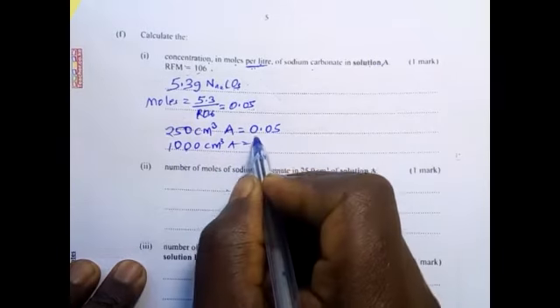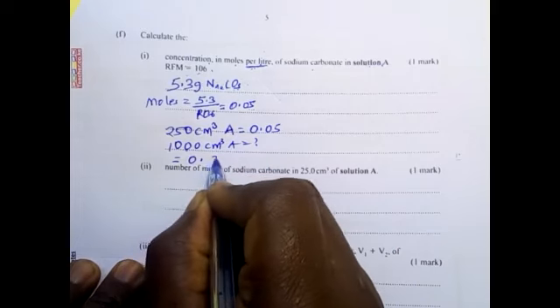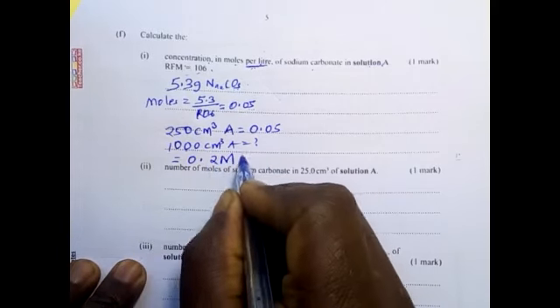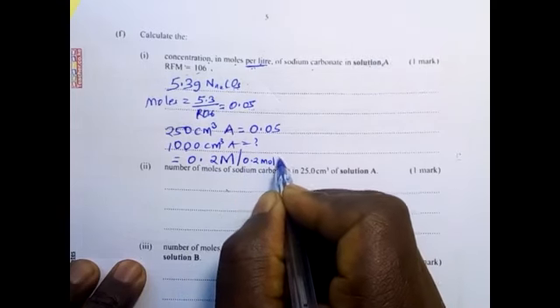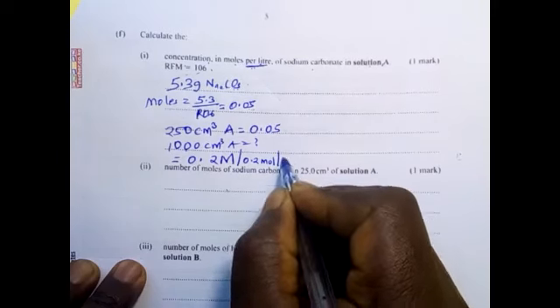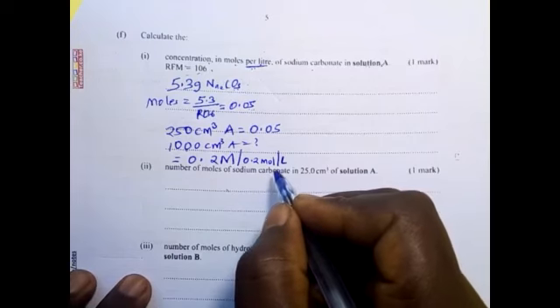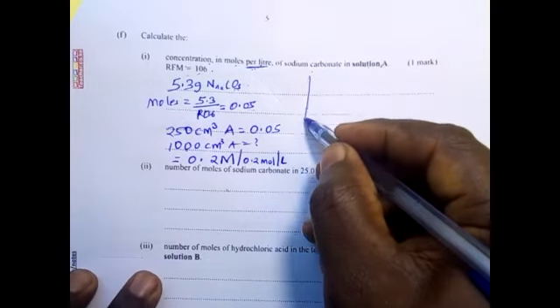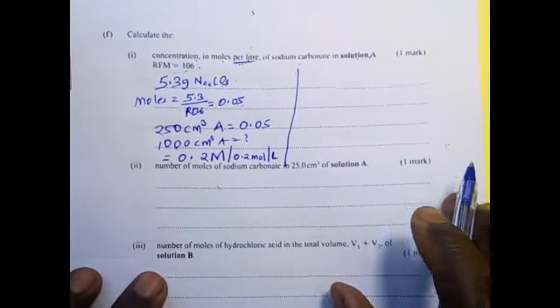So it is 1,000 times this divided by this, which is going to give you 0.2 capital M, or 0.2 mole per dm cube, mole per liter. That's one way you can do it. I want to do it in a different way.